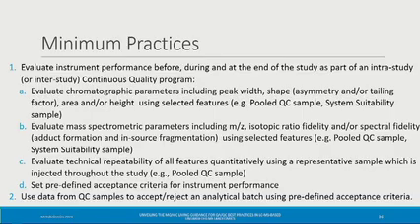I think that's, again, going to be very sample and study dependent, so I don't think we can provide guidance. In general, you have to have your acceptance criteria for a batch, like will I accept this batch as run or not, right? If the batch fails, then it really depends on the study. If you're dealing with precious samples where you already used up your sample, you may not be able to rerun it.